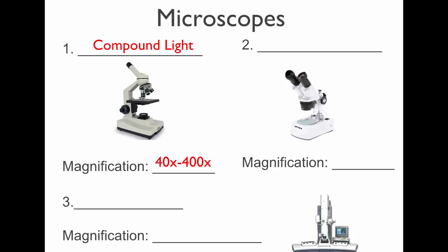This is another type of microscope we'll use. We'll use these on Monday. This microscope is called a dissecting microscope, although it's used for lots of purposes. And it's a little different. It's set up differently than the compound microscope.